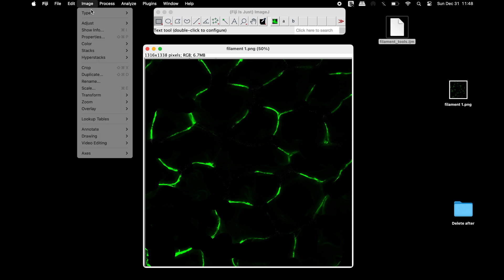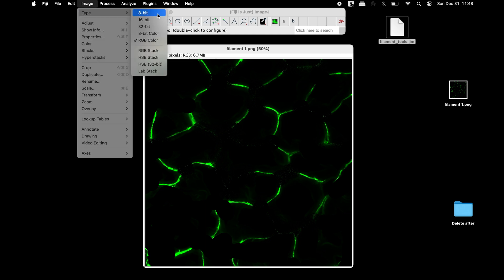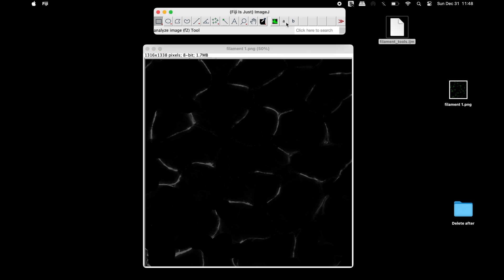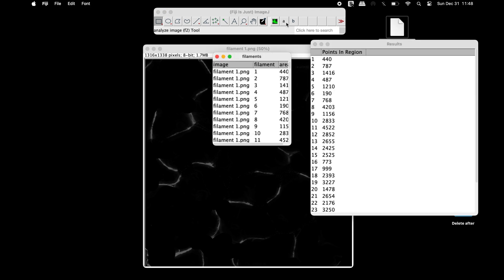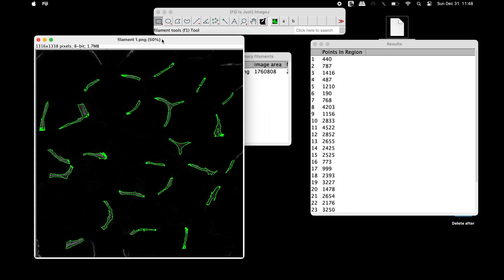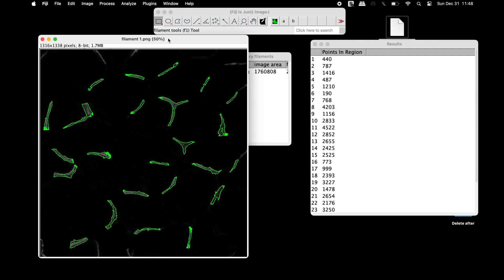The next step is to change the RGB image type into an 8-bit image. Now, make a left-click on the icon A and wait until the macro has completed the analysis.